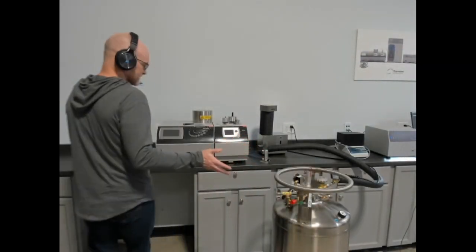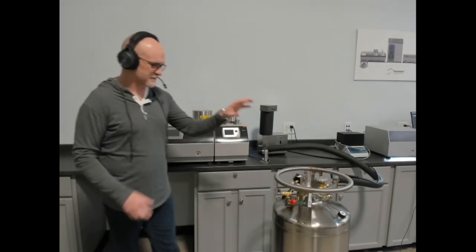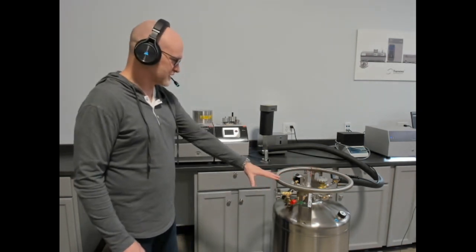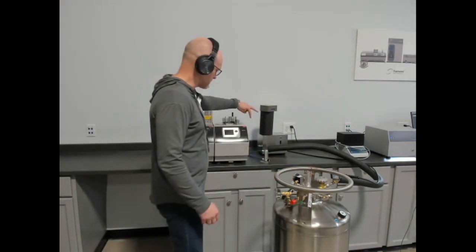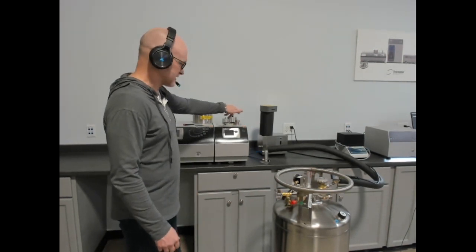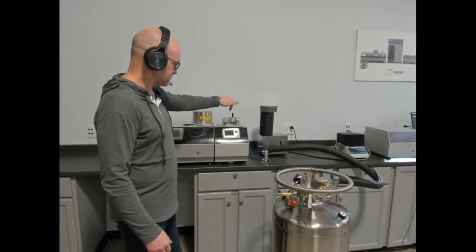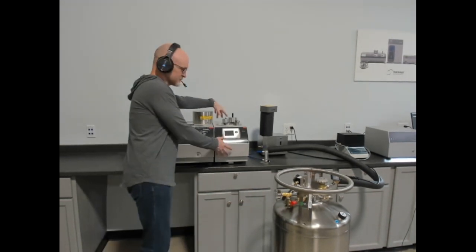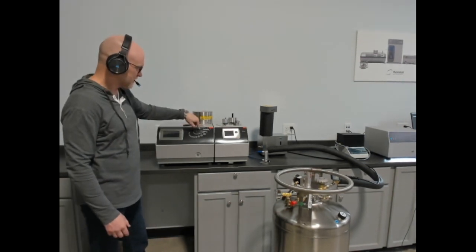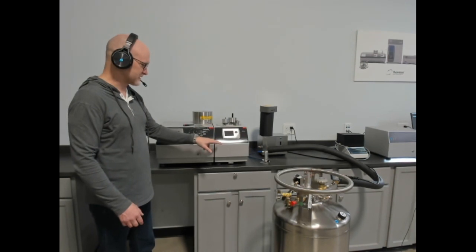just to show what the setup would look like. What are the components of the device? This is a 50-liter dewar that's good for about 24 hours of operation. There's a valve with an auto set temperature feed, and it works off the principle of liquid nitrogen flow and exhaust flow. It's all within the same small footprint, so it allows you to connect to the same controller. And this goes to a lowest temperature of minus 160.